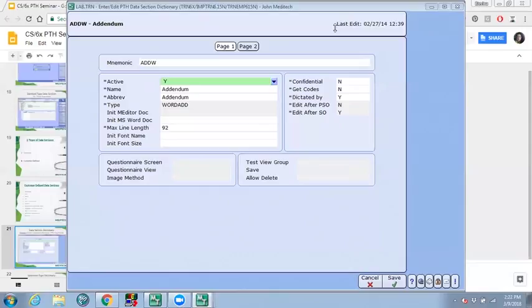So Kim, the next question that she has regarding to bold the diagnosis, you're mentioning if this is a manual process, or if we can set the bold diagnosis only. Unfortunately, yeah, it has to be a manual process. So if it's just one particular word, you'd have to do it manually.